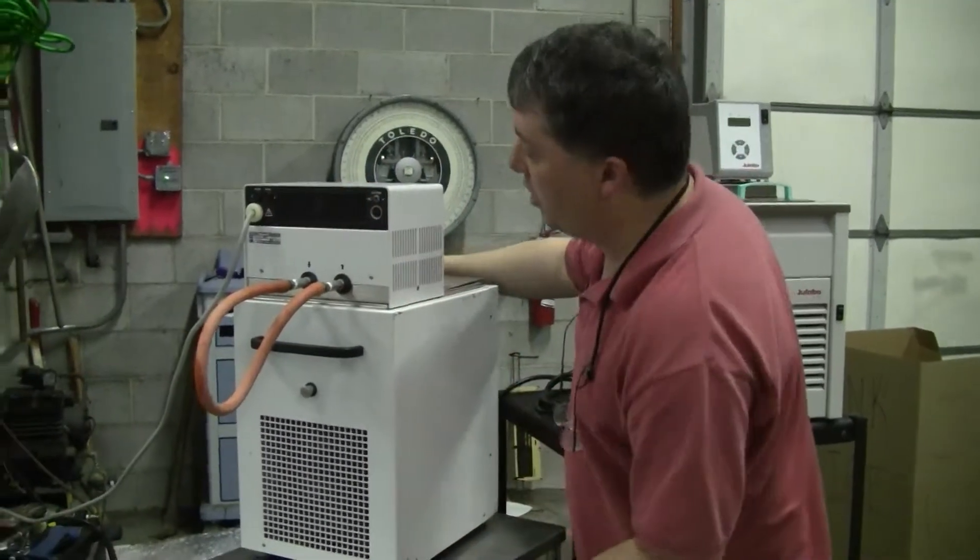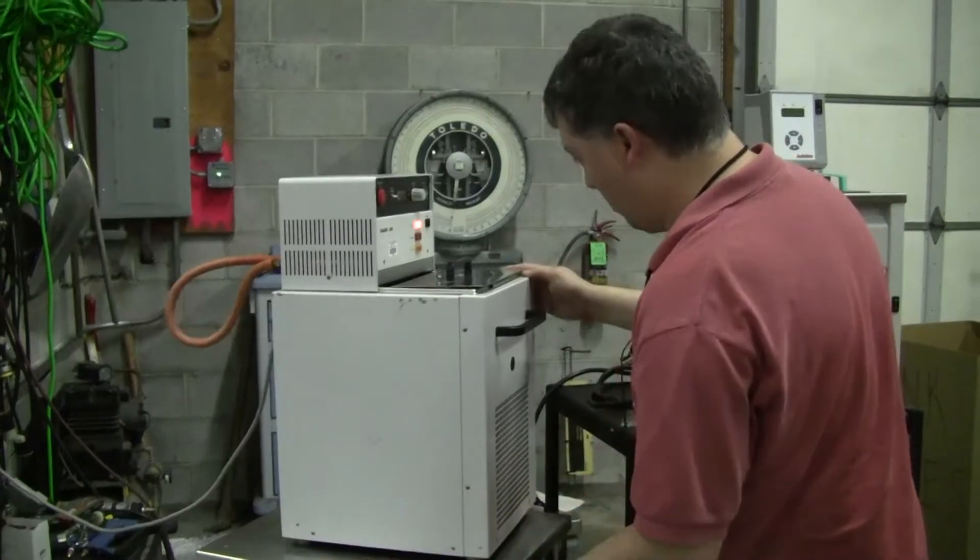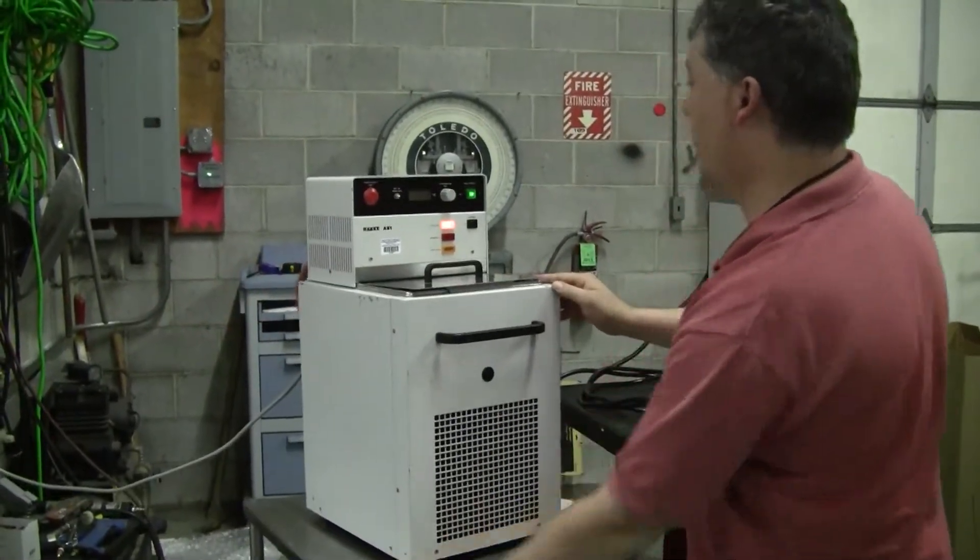There's always an override. When the fuse blows, you have to reset it.